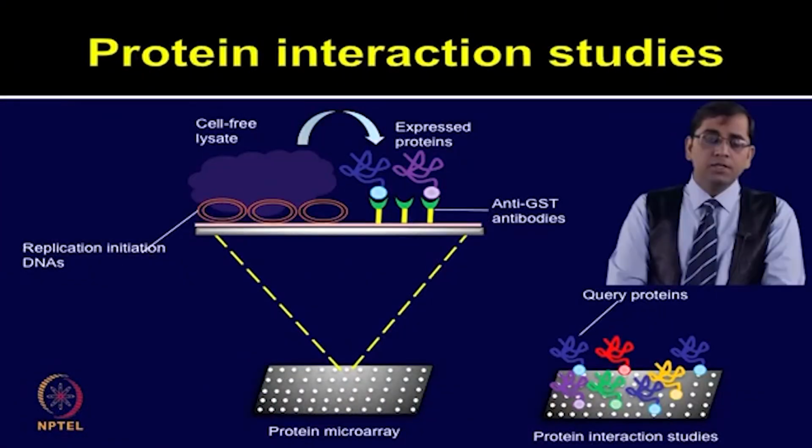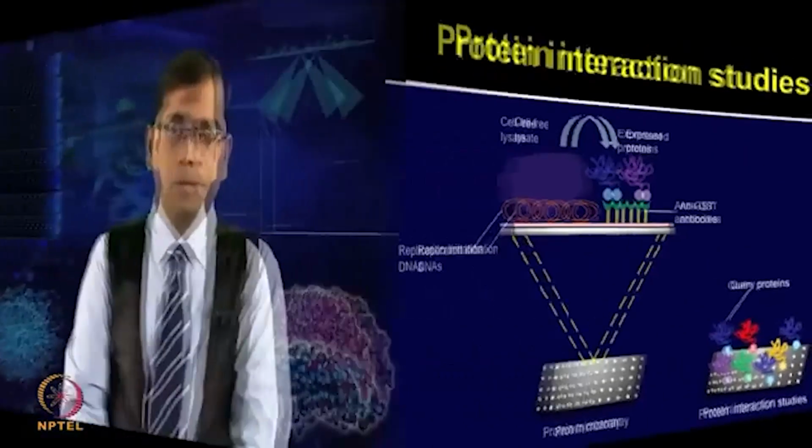NAPA microarrays. Authors reported generation of self-assembling microarrays, which was one of the novel technologies reported in Science in 2004. In this study, Ramachandran et al. used a pairwise interaction among 29 human DNA replication initiating proteins, which recapitulated the regulation of CDT1 binding to the selected replication proteins and mapped its geminin binding domain by using the NAPA approach. Let me describe some of the steps involved in this experiment by showing you this animation.